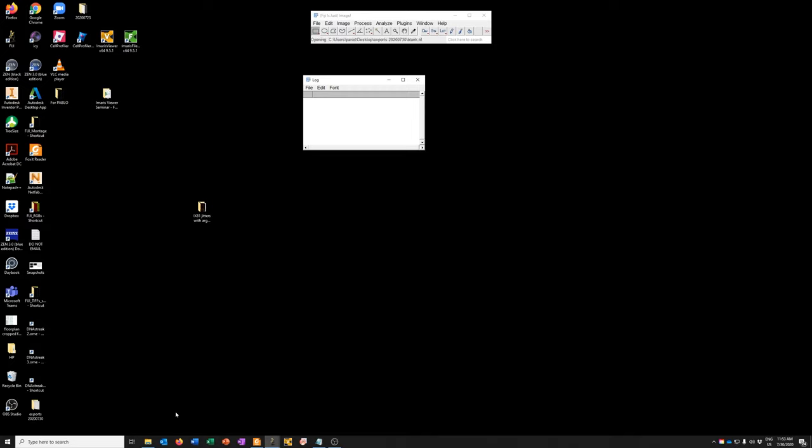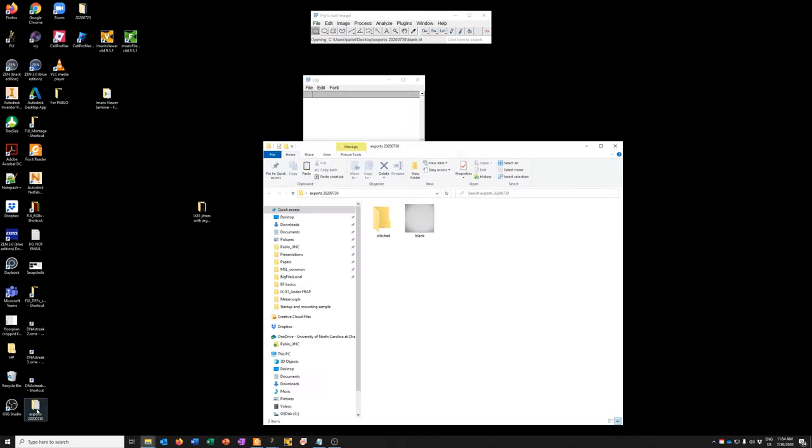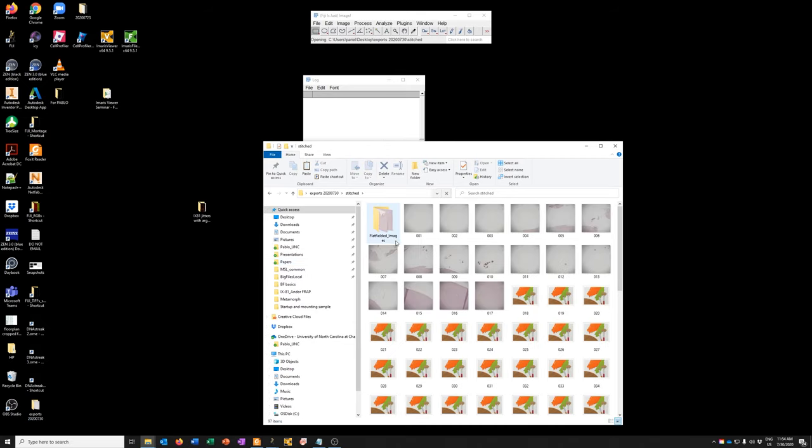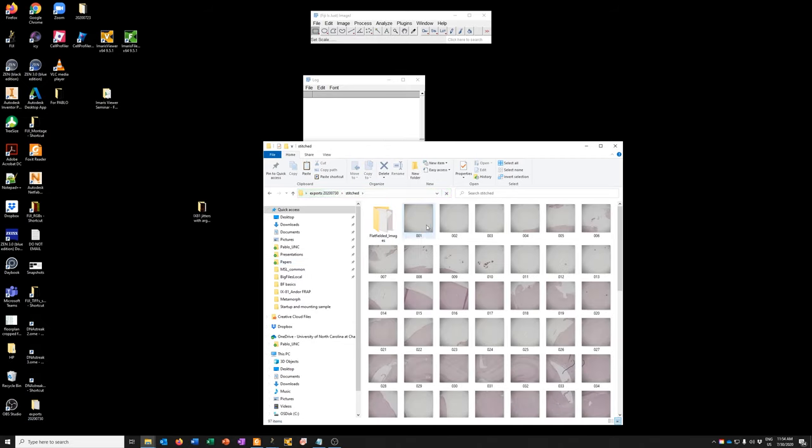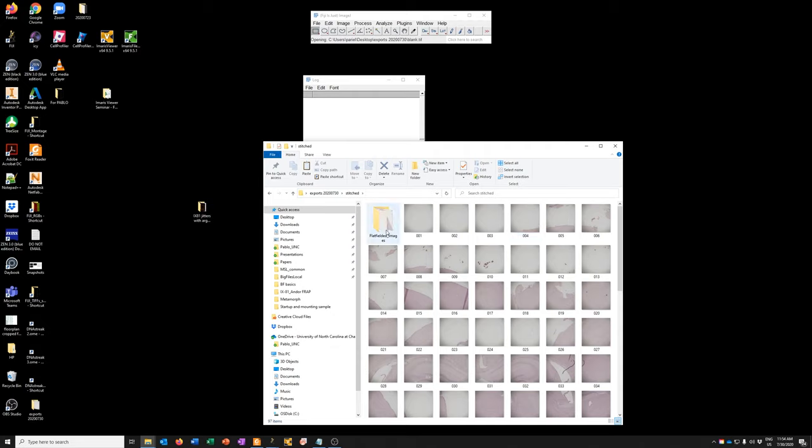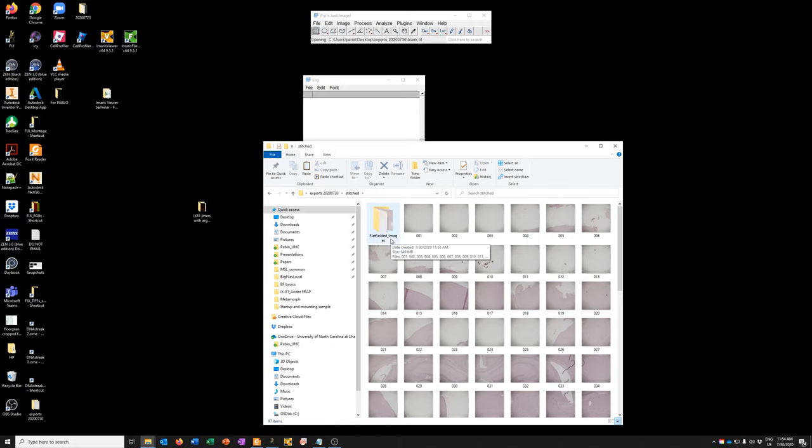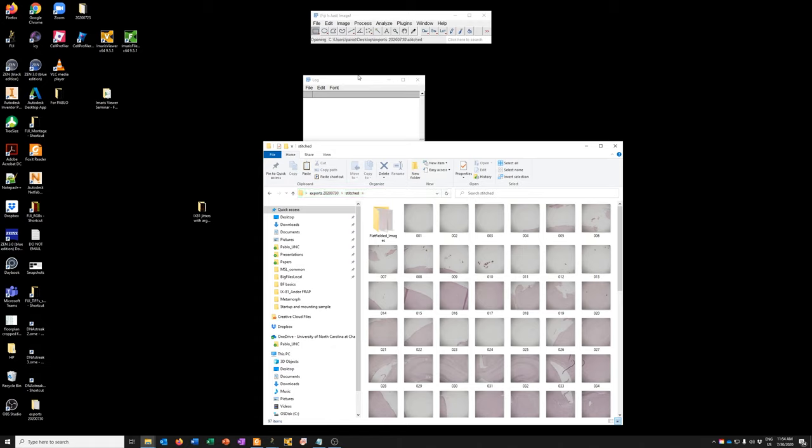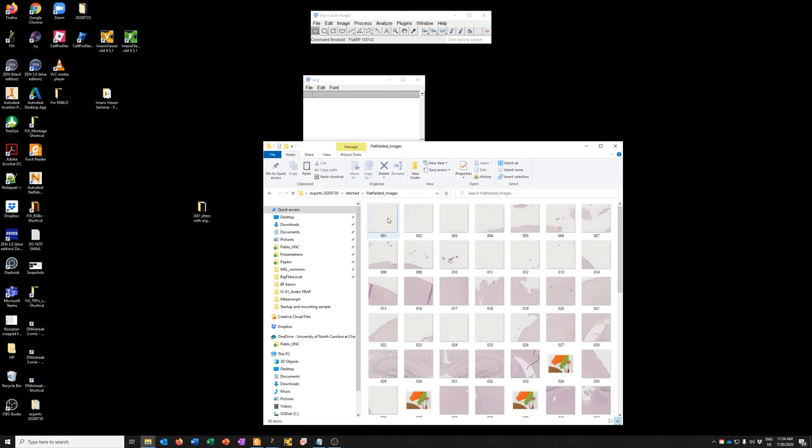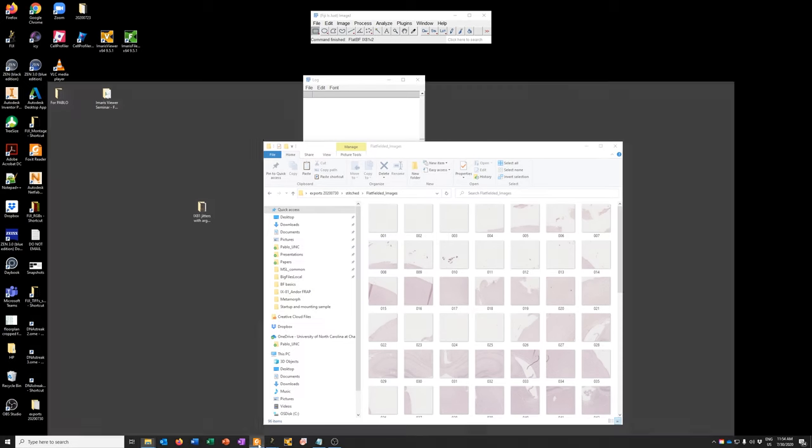And now what's going on is it has created flat fielded images. And it's going through every single one of these and adjusting it based on the blank to create a flatter image. So this can take a while. And when it's concluded, it will say something like complete. I think it's pretty close. And it's done. So now here, we have the same images, but they have been flat fielded. So the illumination is more even. Let's see what the next step is.